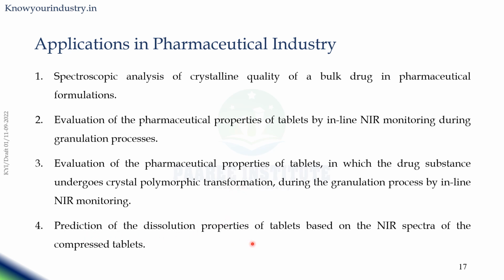And the prediction of dissolution properties of tablets or other solid dosage forms can be made using the near infrared spectra, that is NIR spectra, of the compressed tablets.